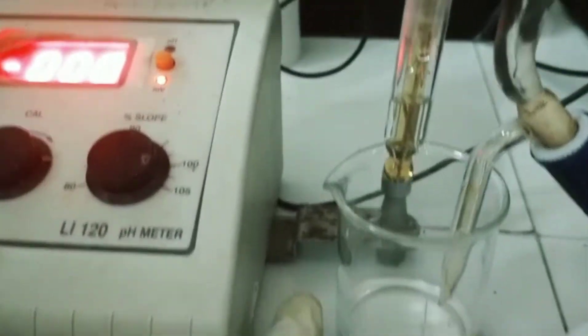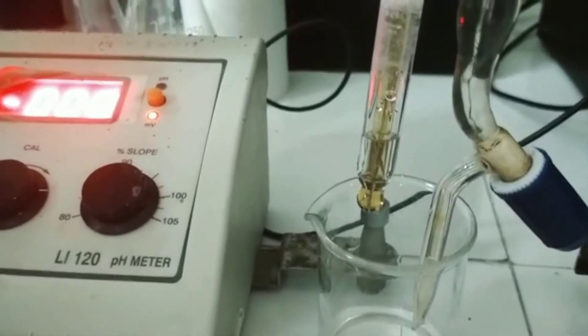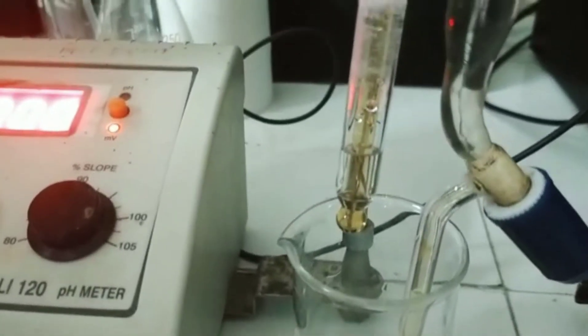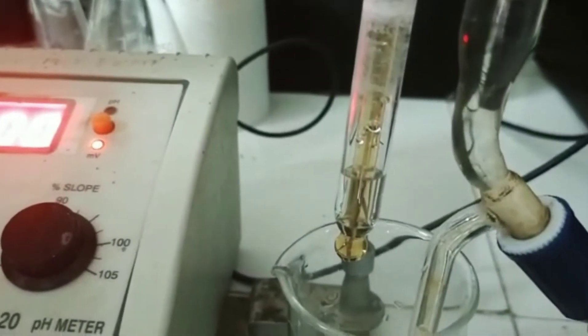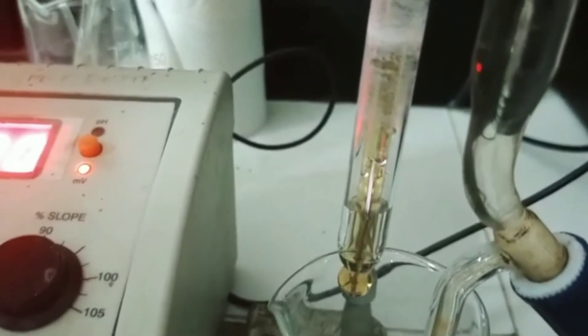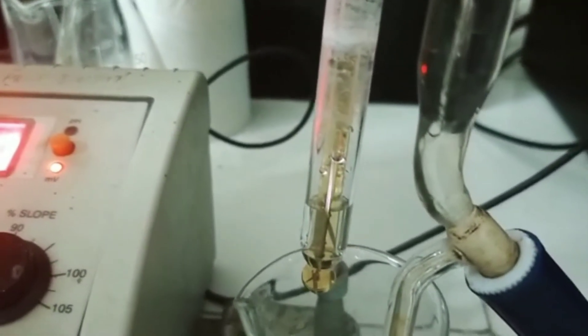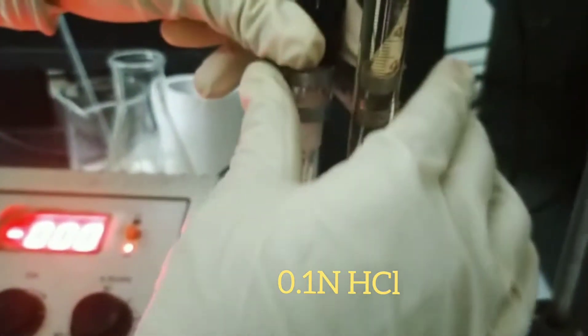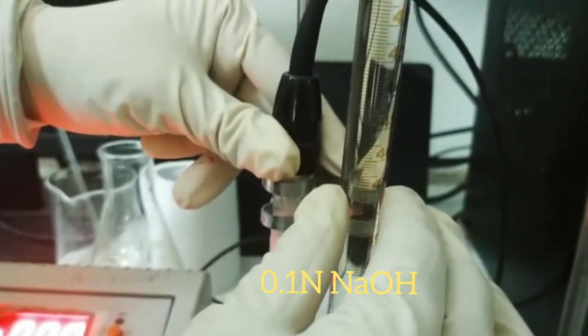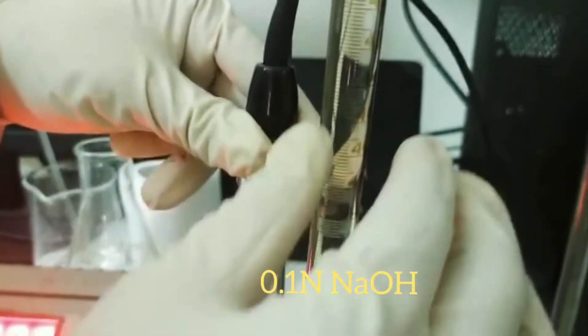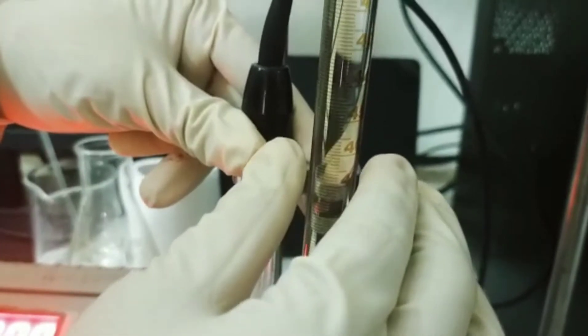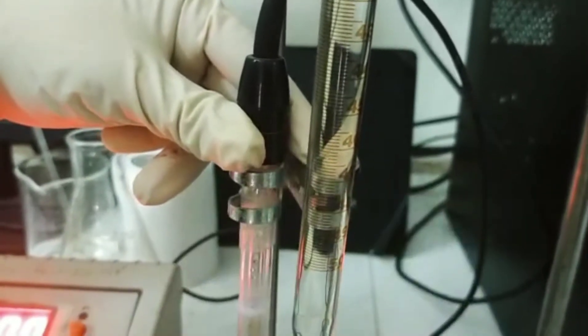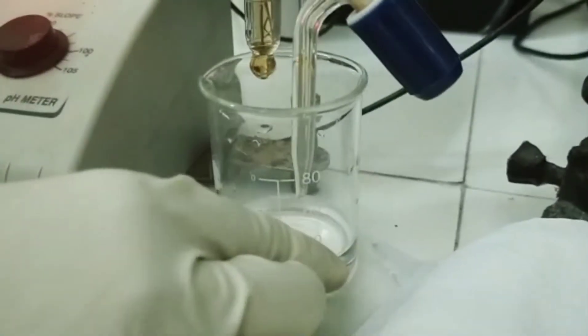So today, I am going to demonstrate a potentiometric titration among acids and bases. That is, I am going to show a titration between strong acid and strong base. For this, I have taken 20 ml of 0.1 normal HCl in this beaker. And I have filled the burette with 0.1 normal sodium hydroxide solution. I have taken a basic solution that is 0.1 normal NaOH in burette. And I have taken 20 ml of hydrochloric acid in the beaker.